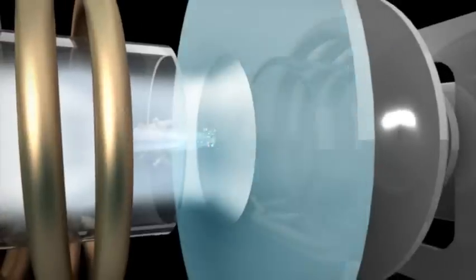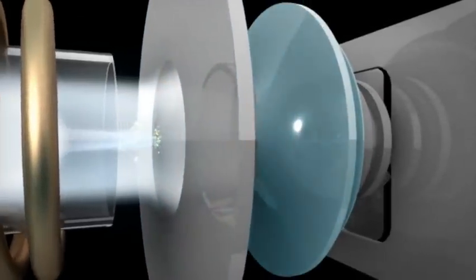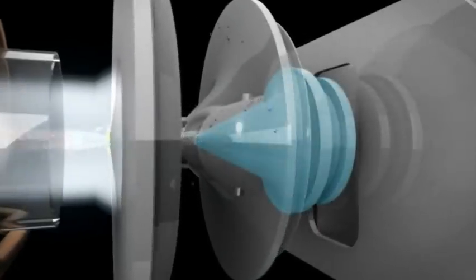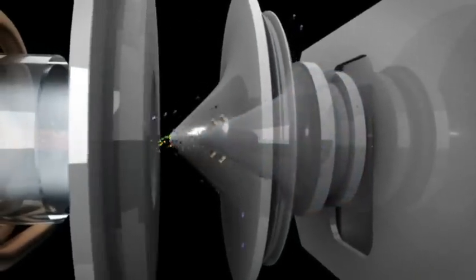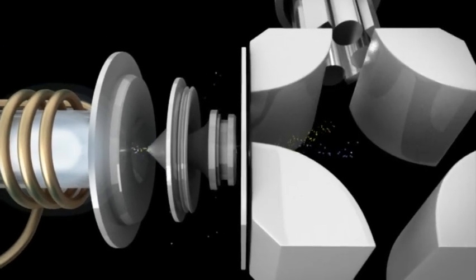Positively charged ions are then drawn through a sampler cone, a skimmer cone, and a unique hyper-skimmer cone that remove unionized material more effectively than typical two-cone instruments.